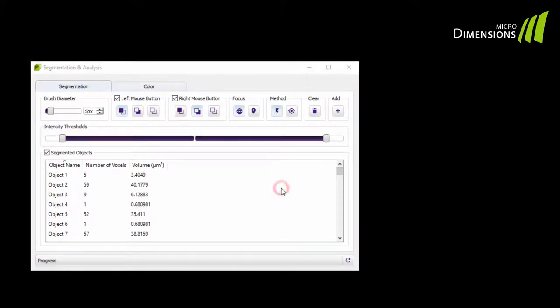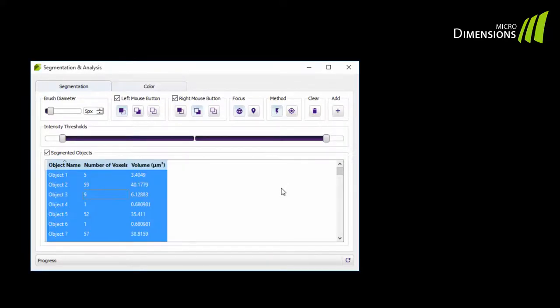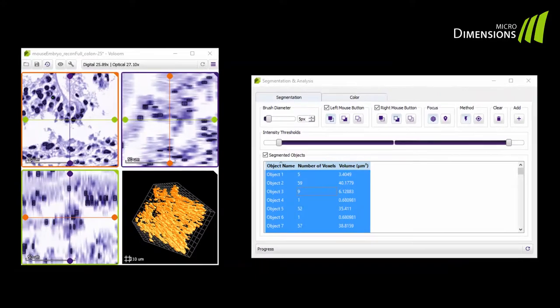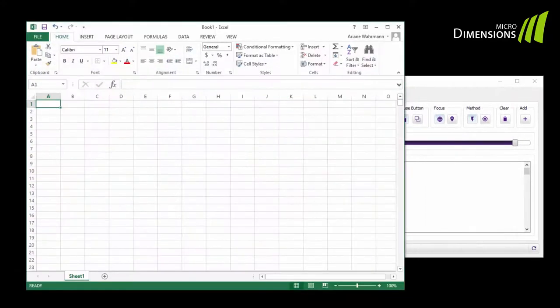You can now copy and paste the results into any kind of statistical analysis software that you like to use. Just click inside the results table, hit CTRL and A to select all objects, CTRL and C to copy them and open for example Excel to paste them with CTRL and V.